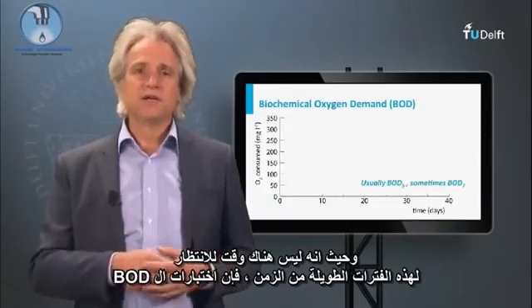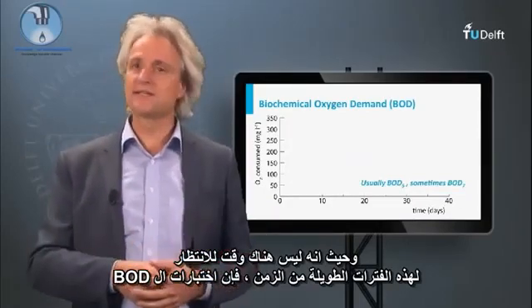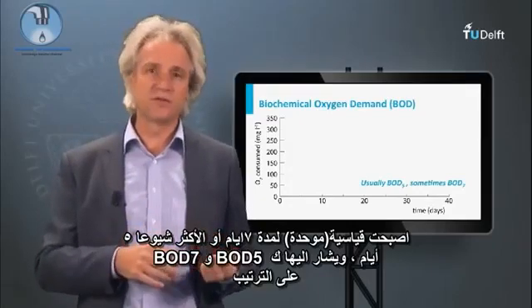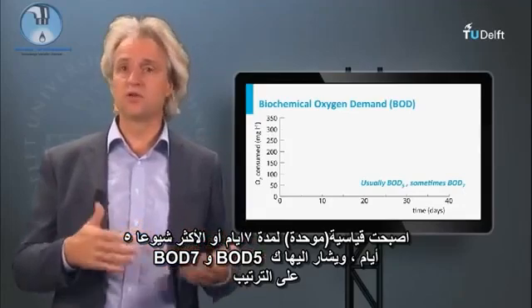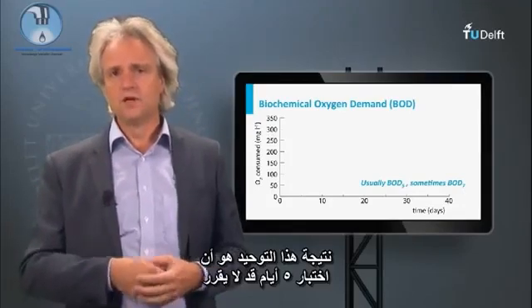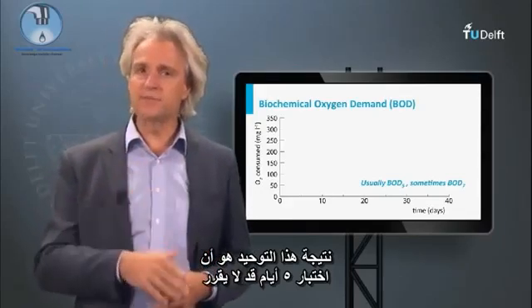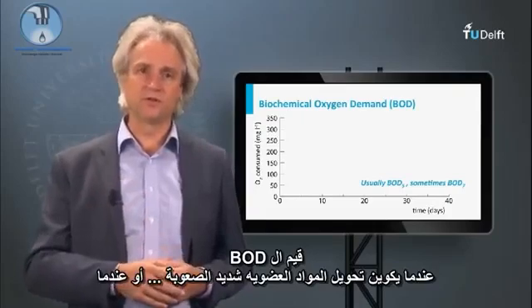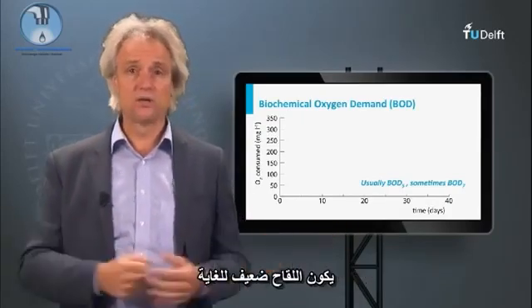Since in general there is no time to wait for such long periods of time, the BOD test is standardized to a duration of 7, most commonly 5 days, indicated as BOD7 or BOD5 respectively. The result of this standardization is that a 5-day test may underestimate the actual BOD value, when the conversion of the organic compound is more difficult or when the inoculum is very poor.